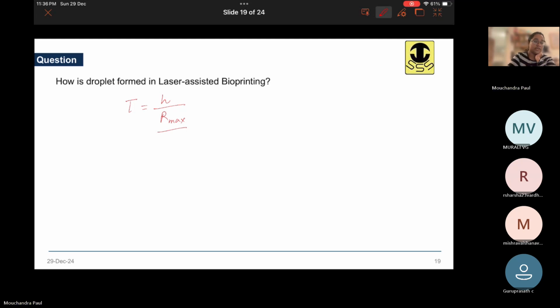So gamma can be in two regimes that we already saw. So go back to that lecture. You have the recording and the PPT as well in order to understand more on how a laser is basically helping in the formation of the droplet, if this discussion is not clear. Otherwise, if you have any doubts, let me know.